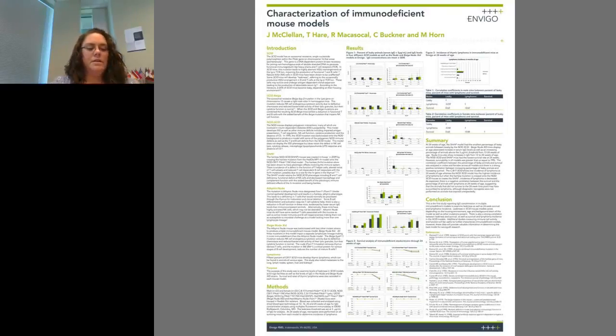So the immune phenotype can vary depending on multiple things, including the background strain, whether it be the CB17 SCIDs or the NOD SCIDs, and age as well, as leakiness can increase with age. It can also depend on extra mutations that are on these backgrounds, such as the lyst beige mutation affecting NK cell activity. A major one is housing environment, which can be considered barrier versus isolator raised animals, which is pretty much just the health standard of the animals that are available.